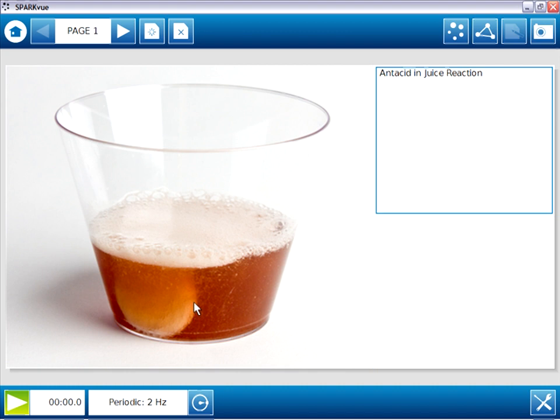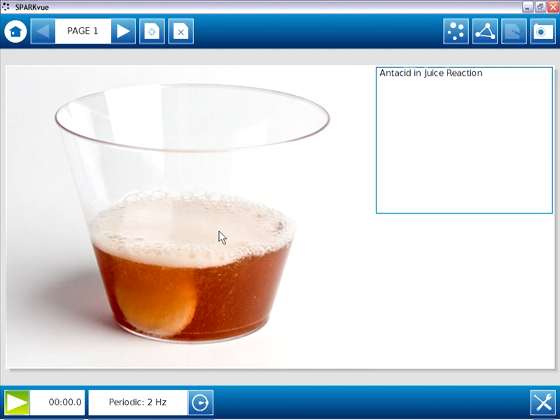We can start on page one, the title page, and we see that the left two-thirds of the page is occupied by a large image, and there's some text in the upper right. This page has two page elements, a small text box in the upper right and a large image element in the left.